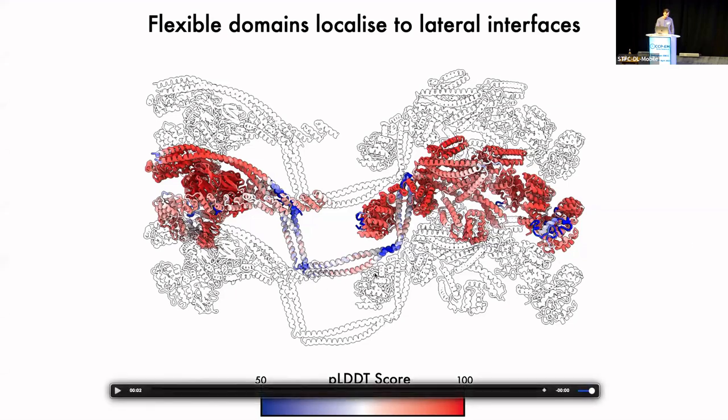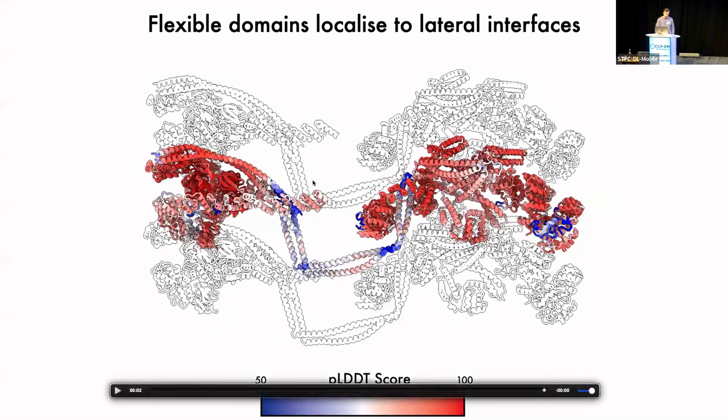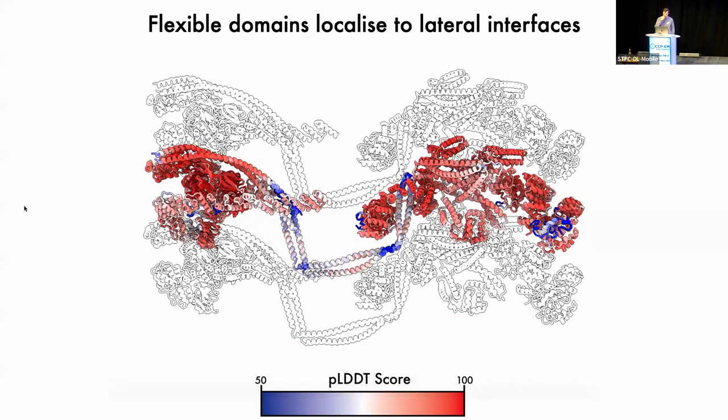So these regions here, this region here, and this region here. And this is unusual because it's not polymerizing in a ball and socket sort of configuration. It's undergoing a flexible to ordered transition, especially considering there are like-to-like interactions, so 2 flexible regions interacting with each other.